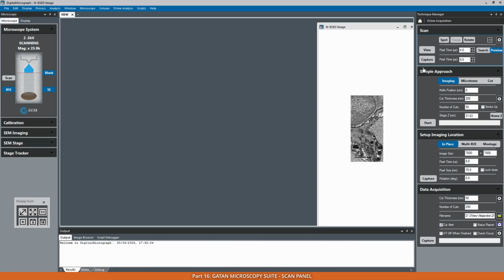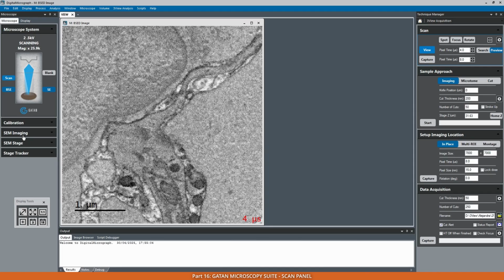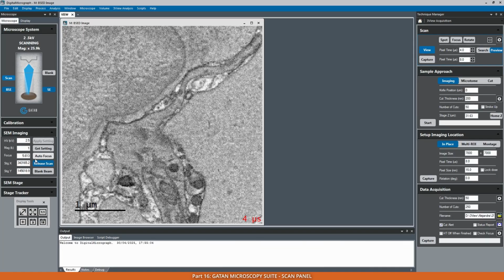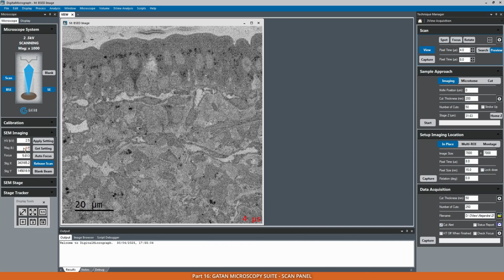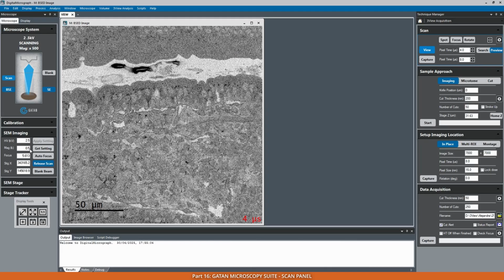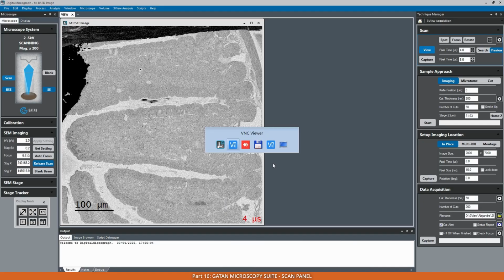Let's first quickly press the preview and then press view to make an overview of what we have. I can't zoom in or out with the controls, but I can do it through these widgets here. I can put the magnification, let's say 1, and then apply settings. Maybe let's put 0.5. So it's not super convenient. It's possible to use, but it's slightly not practical.